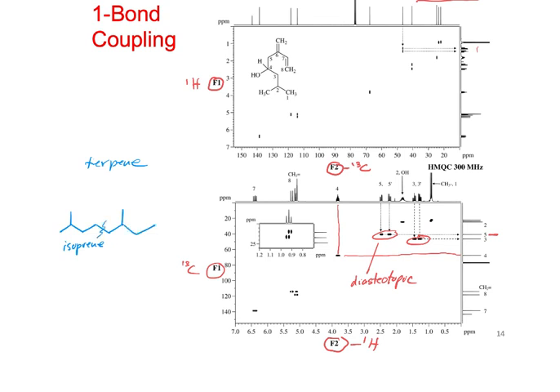So we can always count 1, 2, 3, 4, and then the next one goes 1, 2, 3, 4. And we should have methyl groups on the 2 positions if we count these. So this one isn't too bad, and it's actually just how they counted it already, right? But 1, 2, 3, 4, and there's no methyl group there. What am I doing here? Maybe this is 1, 2, 3, 4, 5, 8, 9.